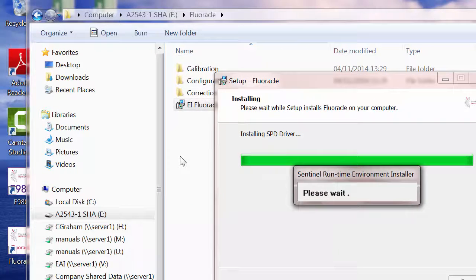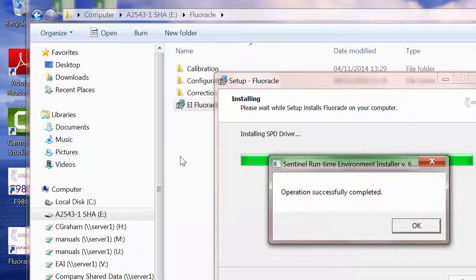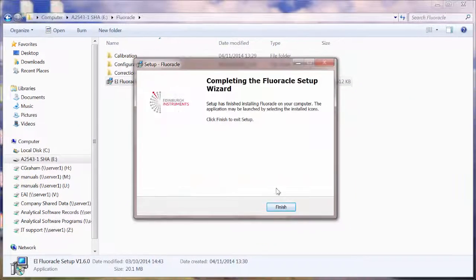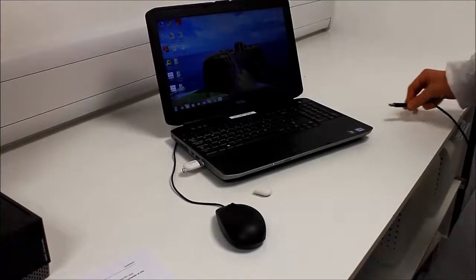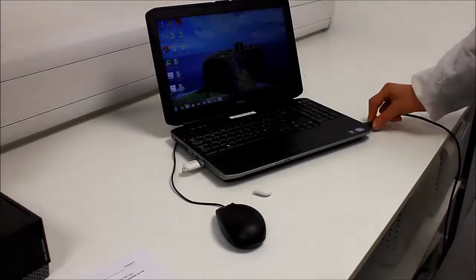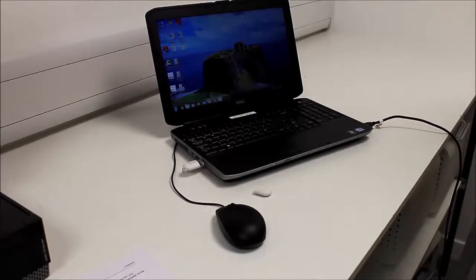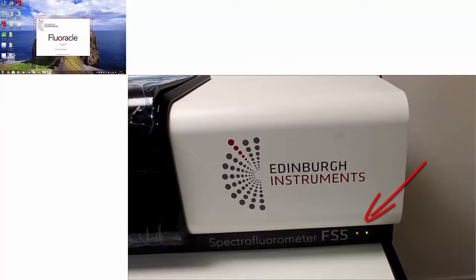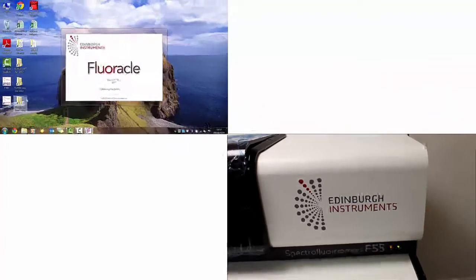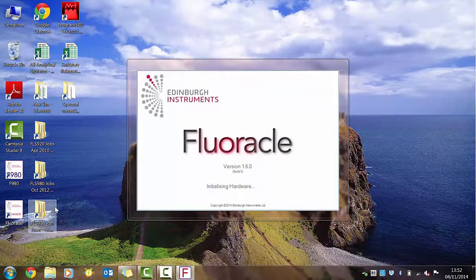Once the installation program is finished, plug in the USB key, find the USB cable linking the PC to the spectrometer, and then launch the Floracle software. The LED on the FS5 will come on, indicating the Xenon lamp has started.